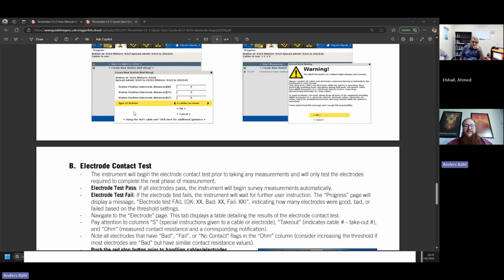And what the safety switch does is it physically disconnects the instrument's power supply from the electrodes. So there's no way to accidentally send anything. In normal use, the instrument should never accidentally send a current. But if something breaks, it might. So the safety switch is just a way to ensure that there's no way to accidentally send a current while someone is using it.